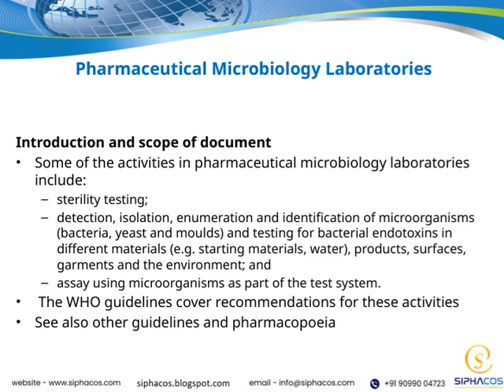Some of the main activities include sterility testing, which is essential for confirming that products are free from viable microorganisms. Additionally, these laboratories are responsible for detecting, isolating, enumerating, and identifying different microorganisms such as bacteria, yeasts, and molds.